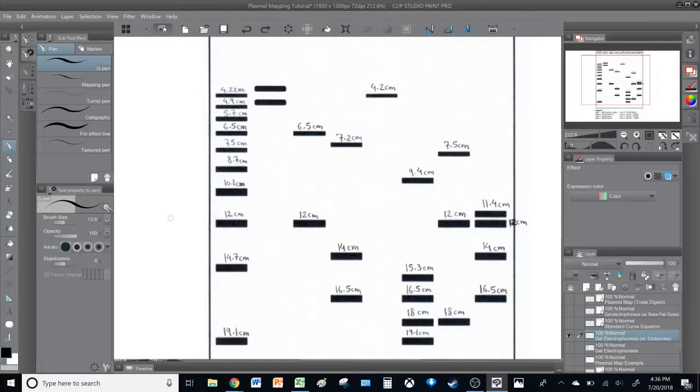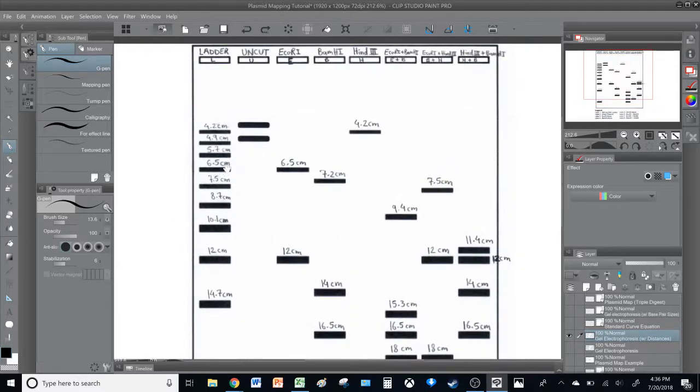We'll be continuing from our last video and we'll start with the creation of the standard curve. So the last time we stopped, we measured the distance for each band in every lane. And then I wrote the distances here. But please make sure that if you're using one unit, to keep it consistent, so do not use centimeters on one band and millimeters on another band, because if you use different numbers on your standard curve, then you will not be able to obtain the correct curve for the calculations.